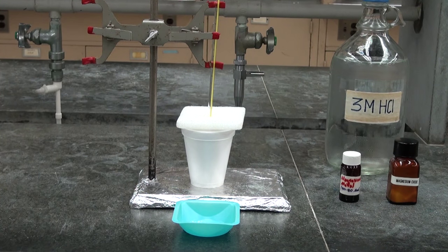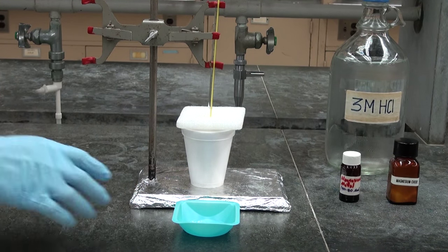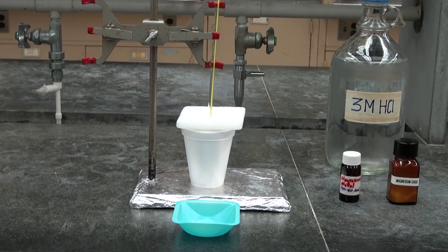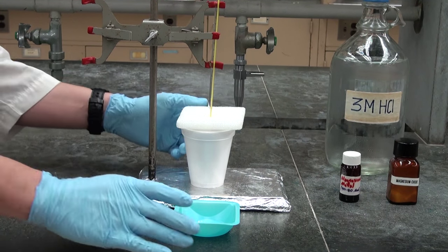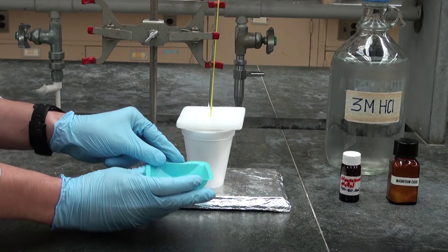With our coffee cup calorimeter set up, we should wait three minutes to allow the temperature to equilibrate, meaning that the temperature should not be moving. At that point, we can then add the magnesium oxide to the hydrochloric acid.